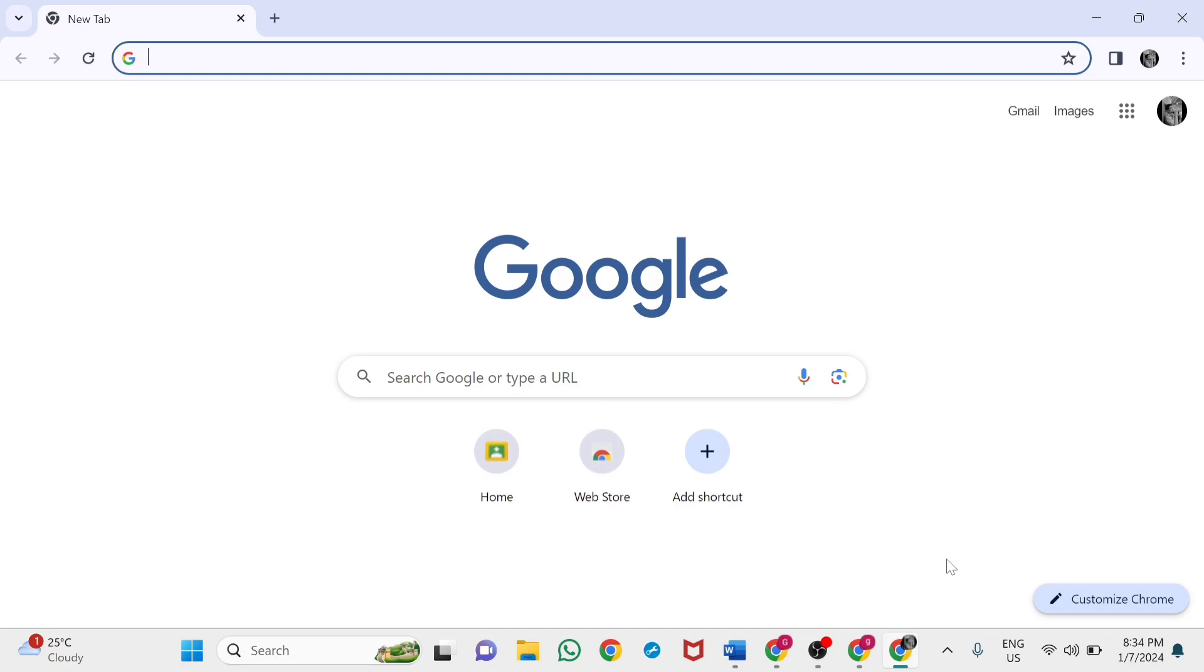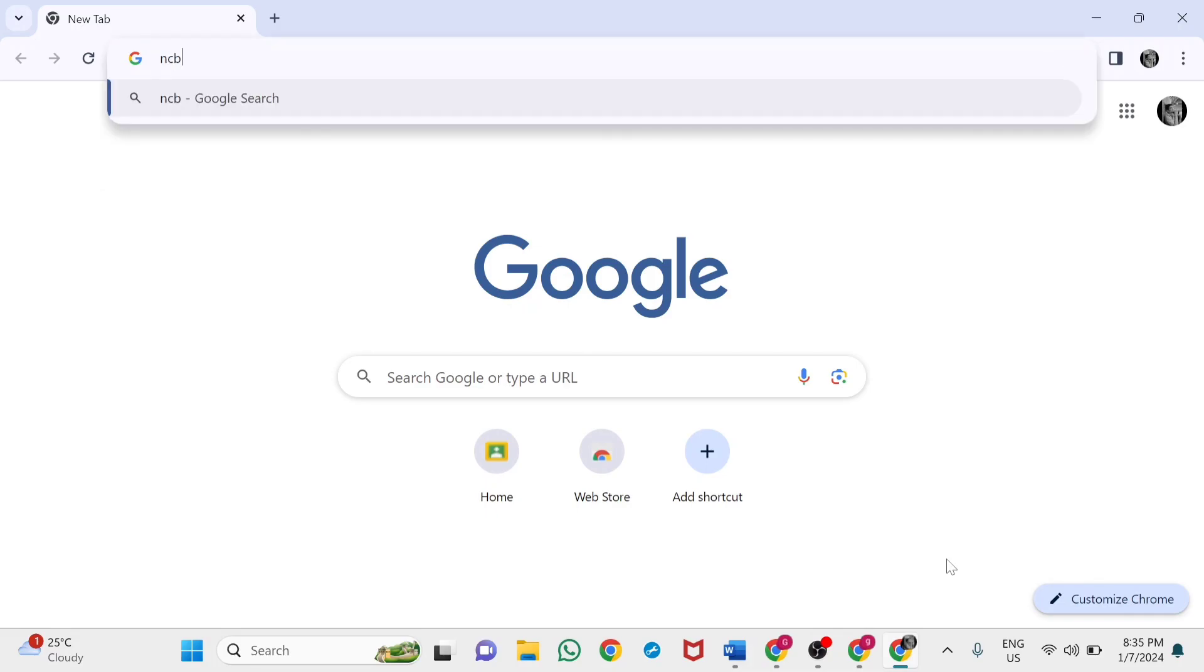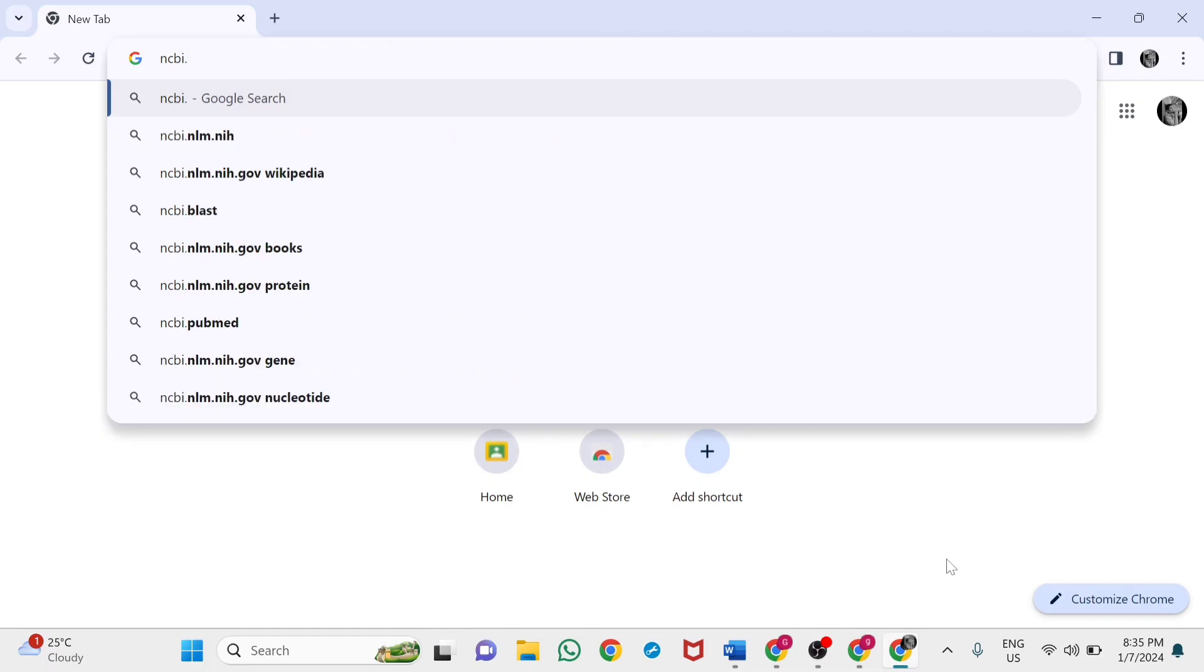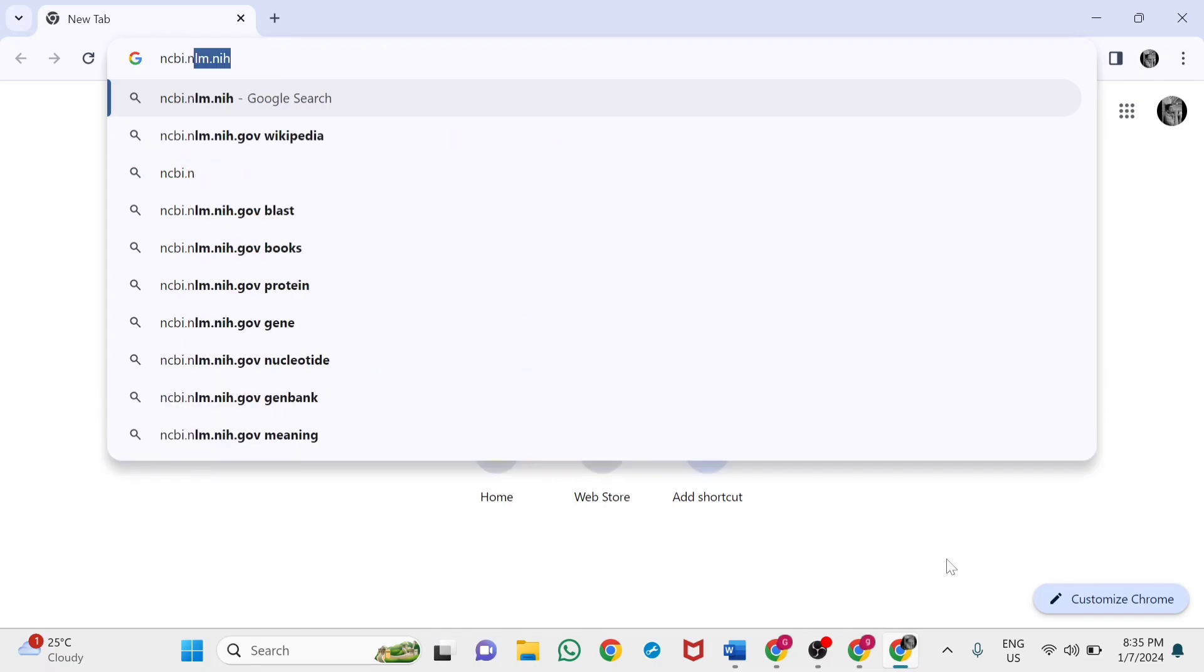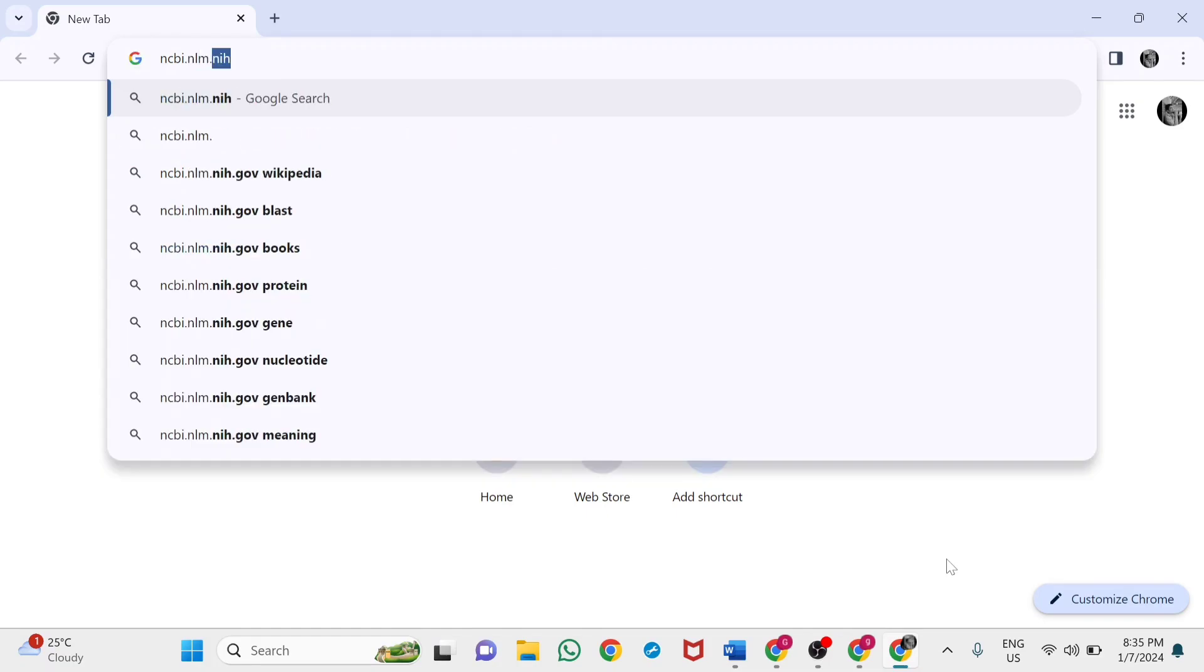Welcome to my YouTube channel. In this video, we'll see a tutorial on how to research and retrieve DNA sequences of proteins from the GenBank database. Go to your browser and type NCBI.NLM.NIH.